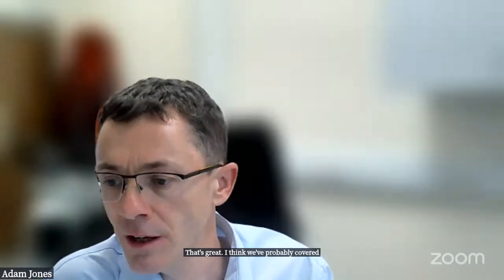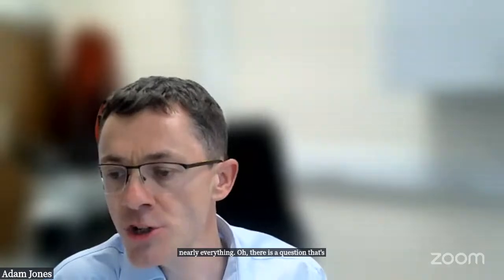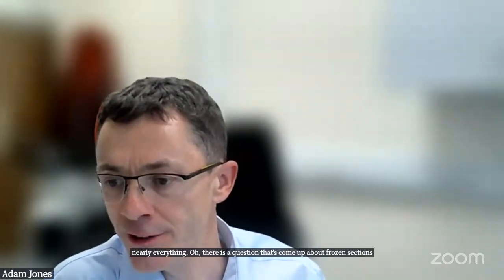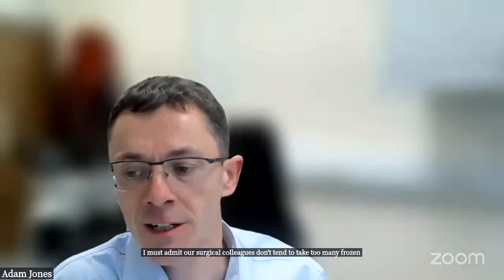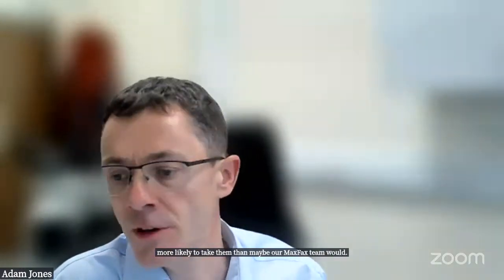That's great. I think we've probably covered nearly everything. Oh, there is a question that's come up about frozen sections on specimens. I must admit, our surgical colleagues don't tend to take too many frozen sections, actually. My ENT colleagues would be more likely to take them than maybe our MaxFax team would. Anybody like to comment on that?